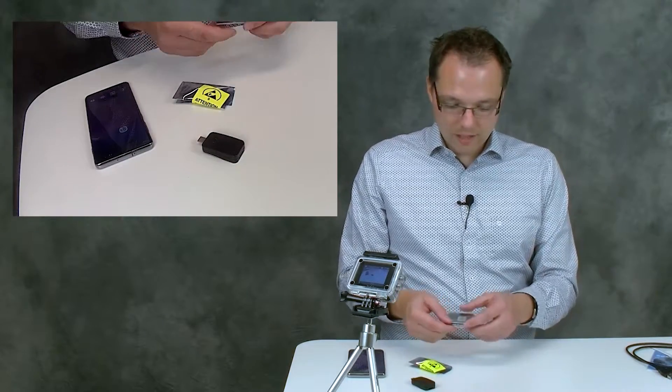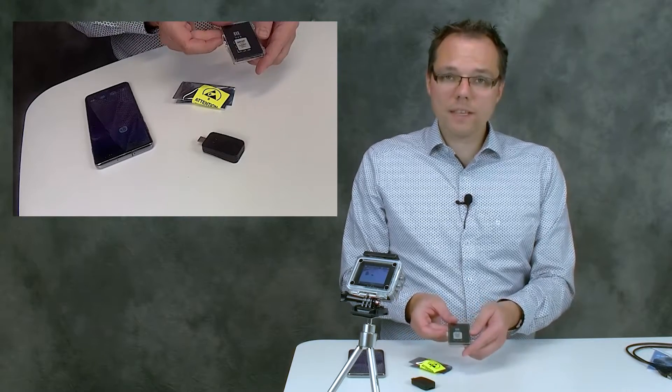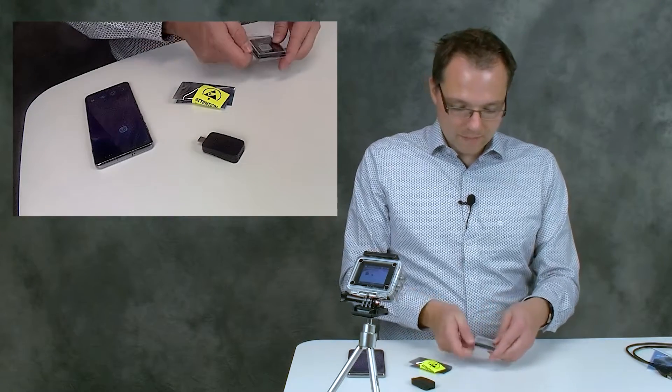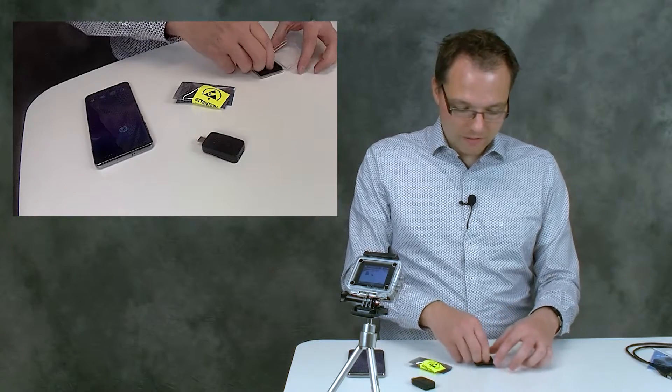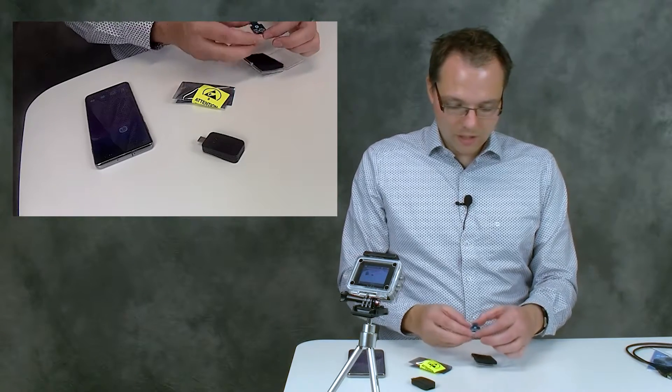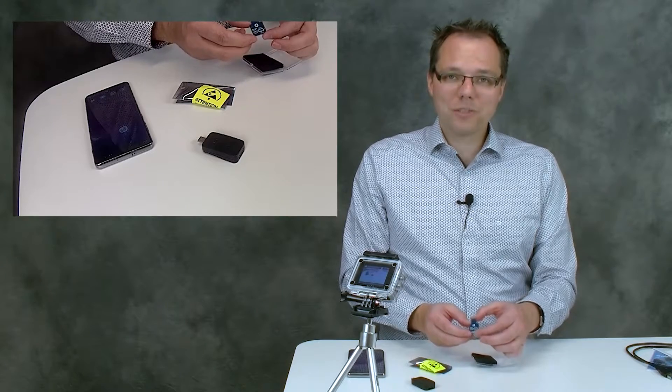Then we have here the dummy cell that we're going to use today. If you turn the dummy cell around, you can also see what's actually in there, and it's a Randall circuit.